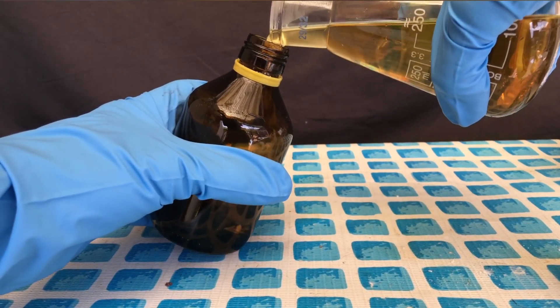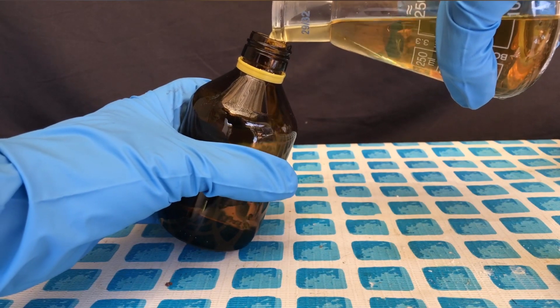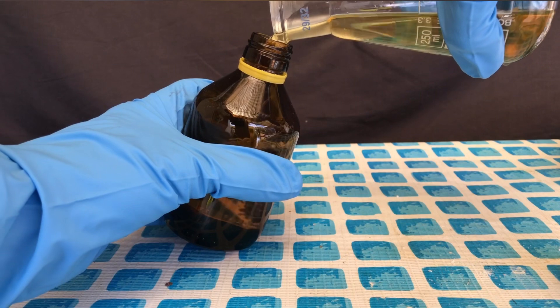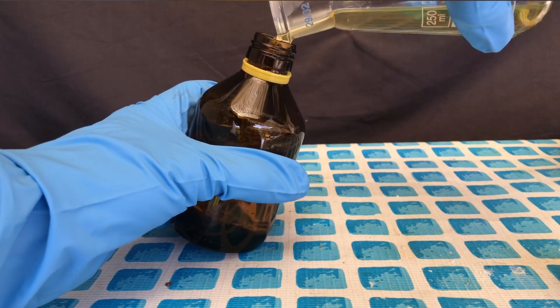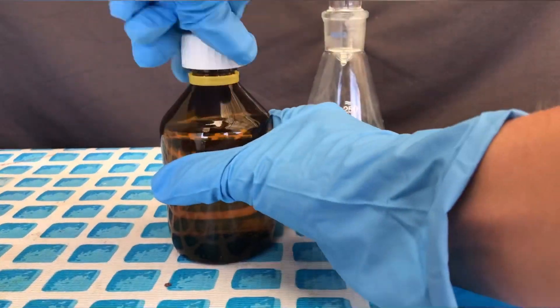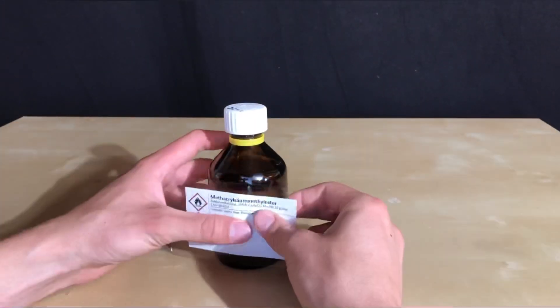The product you see here, methyl methacrylate, is already pure enough for my purposes. If a really pure product is needed, you could redistill it. The bottle was capped, labeled appropriately, and then wrapped in aluminum foil to keep light away from it.